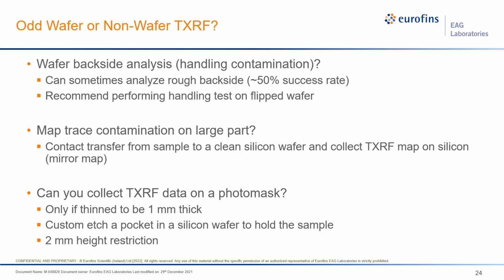So this seems a bit outlandish, but it has been tested and it does work. It may not be useful for spot checks on a photomask, but if you're trying to hunt down systematic contamination on a photomask, perhaps a particle contamination, this can be a way to locate it.